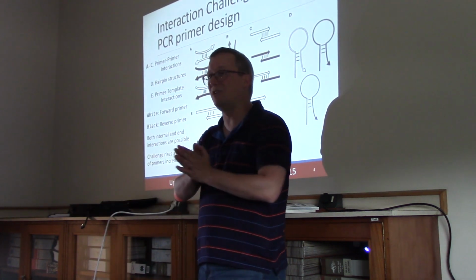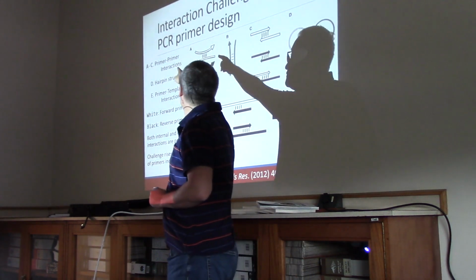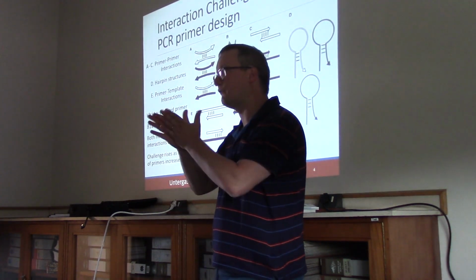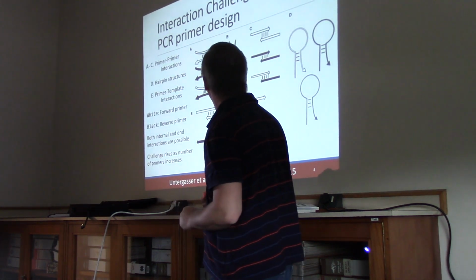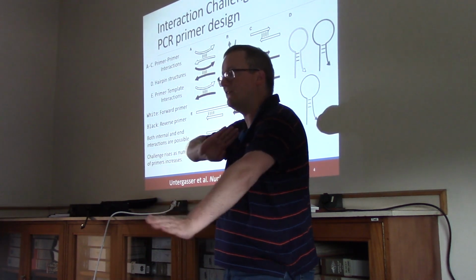If the primers are all lost to the PCR reaction because they're interacting with themselves, that's obviously no good. So we see that the forward could interact with the forward, the back could correspond to the back, or you might have this weird interaction where the forward and reverse primers anneal to each other. Not very viable.